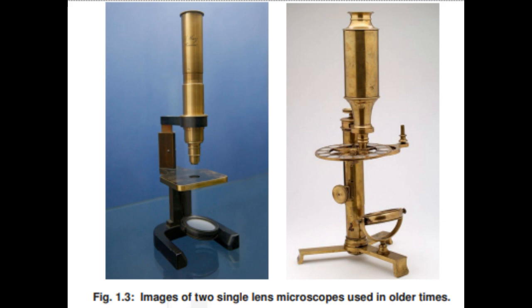We need to be familiar with some terms such as magnification, resolution, numerical aperture, illumination, and focusing before studying in detail about the instrument. Magnification and resolution affect the functioning of the microscope to a great extent. The working of a microscope is based upon the basic principle of magnification.